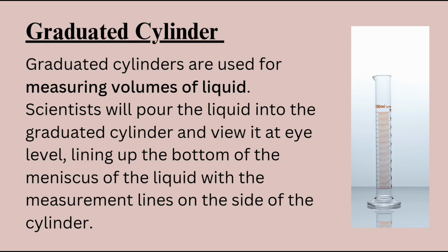Graduated cylinder. Graduated cylinders are used for measuring volumes of liquid. Scientists will pour the liquid into the graduated cylinder and view it at eye level, lining up the bottom of the meniscus of the liquid with the measurement lines on the side of the cylinder.